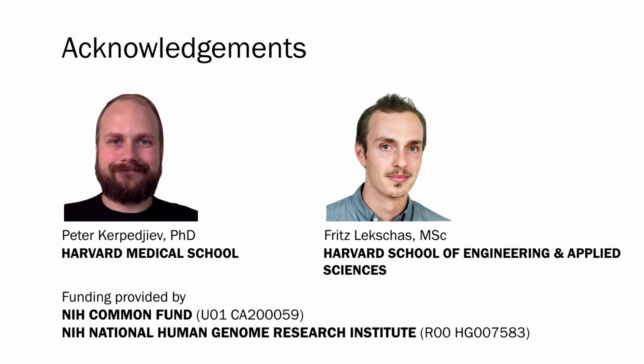Okay, so that's an excellent question. The most important part, actually, in for example this HiPiler project, was to understand the problem space, the problem domain. So we started by talking to people who analyze this kind of Hi-C data on a regular basis and who are experts in processing and analyzing this kind of data, and tried to learn from them. What do they actually need to do with it? Because we are bioinformatics, but we're not experts on Hi-C data.